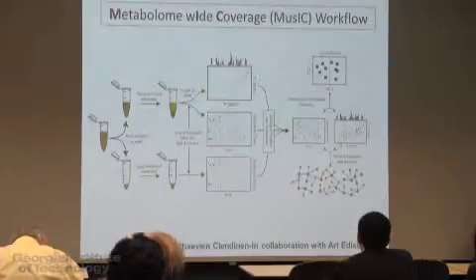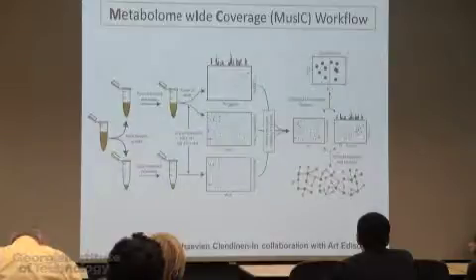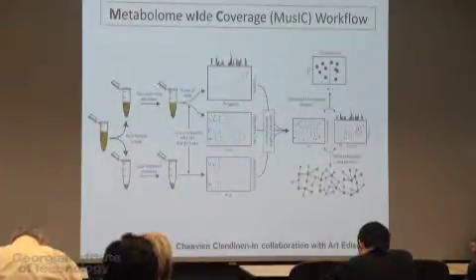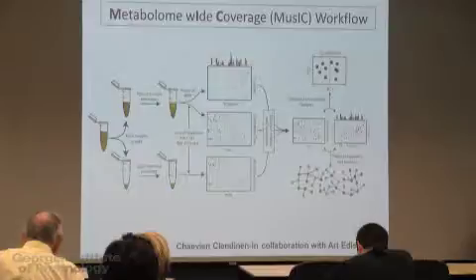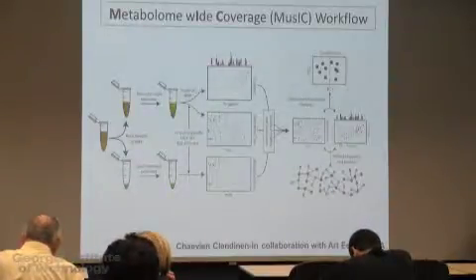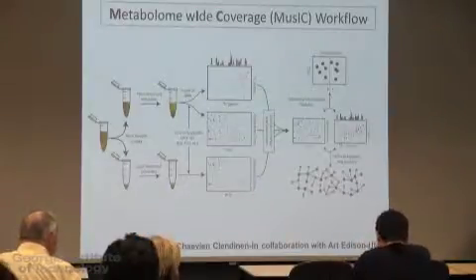But you need to find a way of combining these and obtaining what we call features. Features are either pairs of mass to charge and retention time, or frequencies in the NMR, and then identify those metabolites which are going up and down. So this whole protocol is what we're using right now on systems that we already done some pilot work. In the case of the mice, we didn't start like this because we didn't know if there was going to be anything in early stage mice.